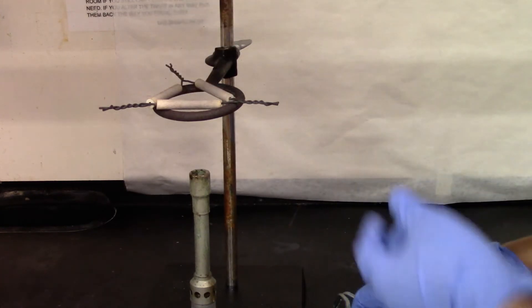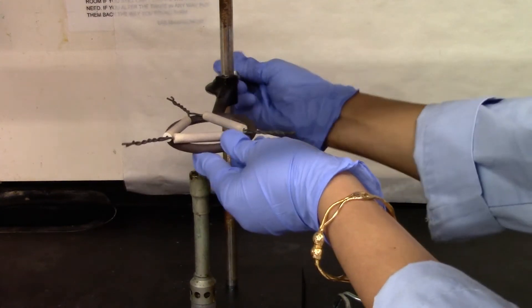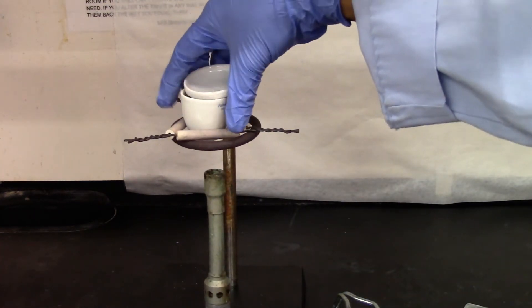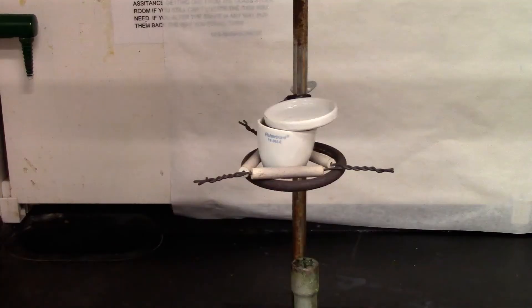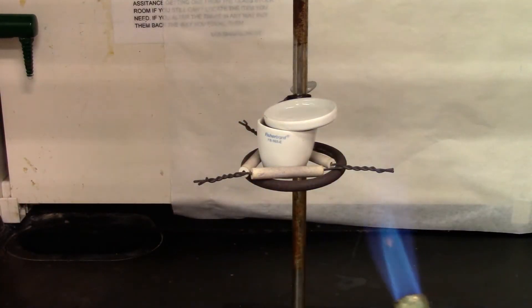I'm going to adjust the height of the ring clamp so the heating could be strong. I'm going to strike my burner. I'm going to adjust the height of the flame and then place it underneath.